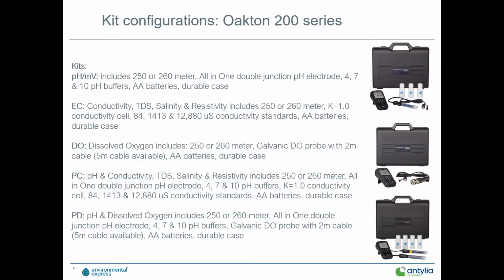Now, the big difference there is there's additional stability testing, dilution testing done on the Oakton traceable. But the key here is it does include an NIST traceable certification. So that's a big deal with some auditors. Some auditors are happy that you have fresh buffers and you're calibrating your pH instruments daily, and that'll meet their requirements. But the key here is talk with your auditor or regulator to make sure that you're in compliance with their pH reporting.